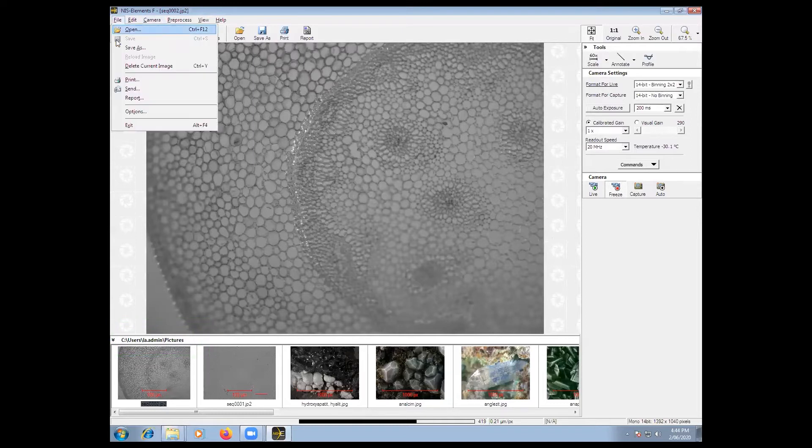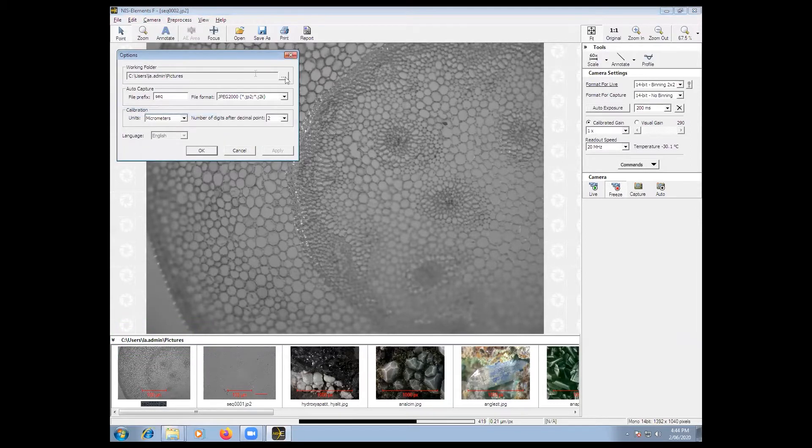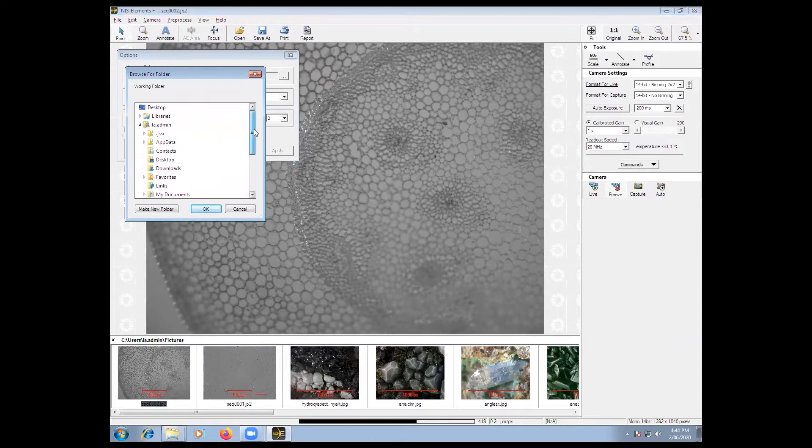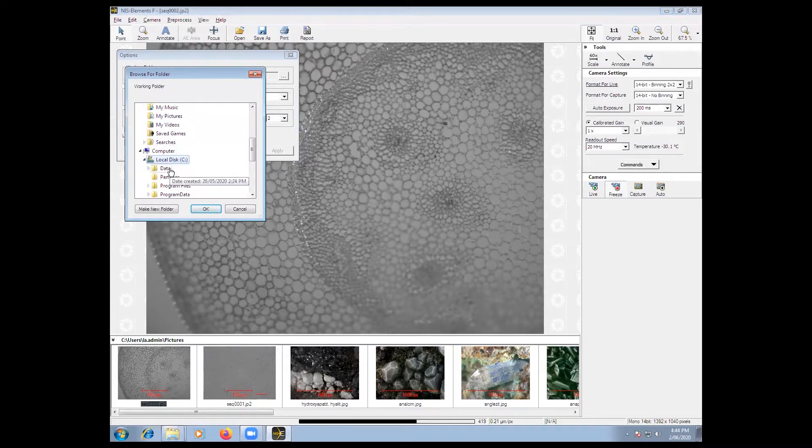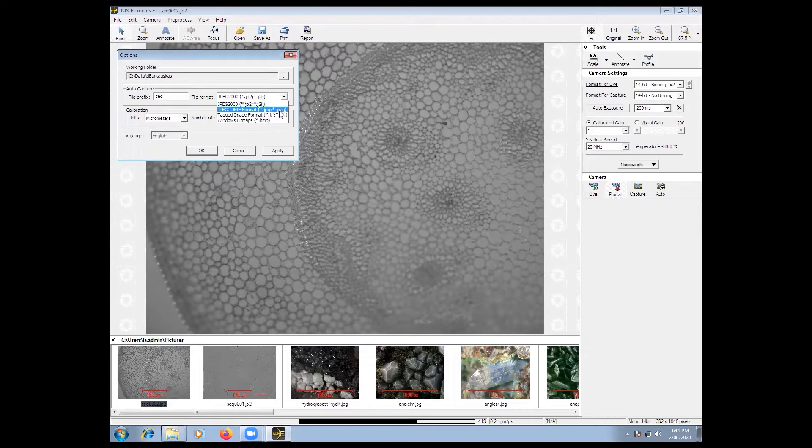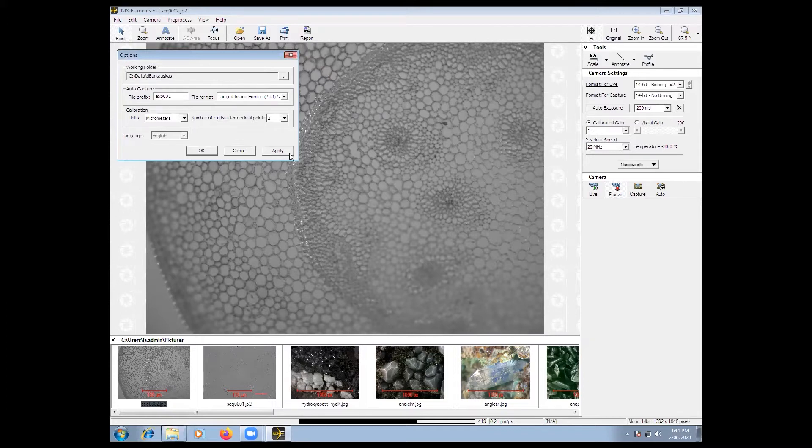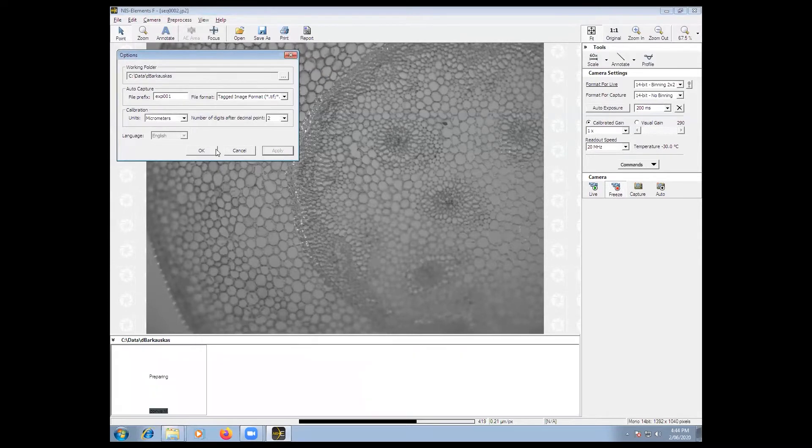Go to File Options and save to your directory underneath C data. Make sure you have saved your files as TIFFs. All other options result in compression and loss of data. You can input a meaningful prefix to all your images and the image number will increment automatically.